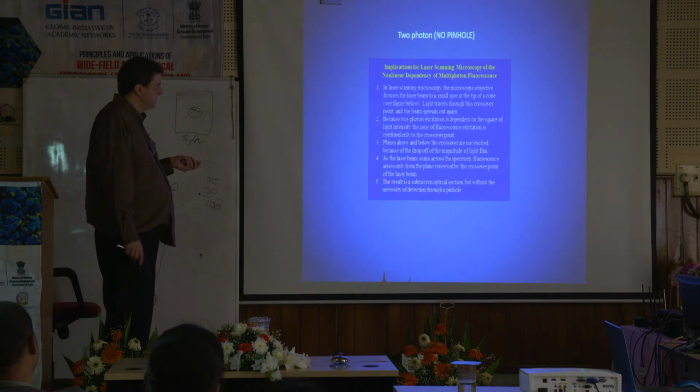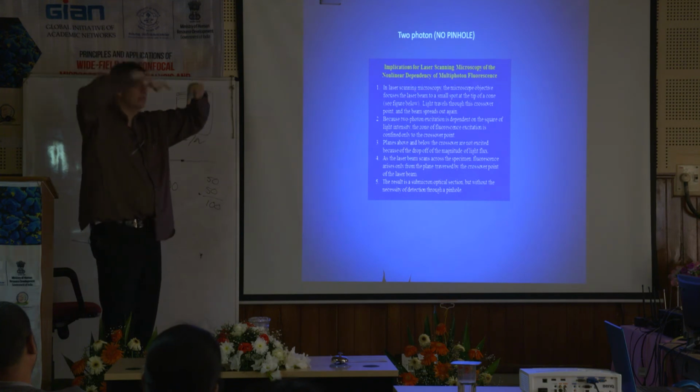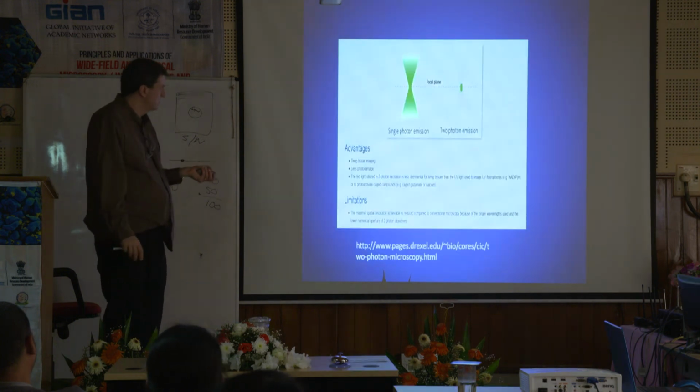Okay, so basically the take-home message, the result is a sub-micron optical section, but without the necessity of it coming through a pinhole, because you don't need a pinhole because the only place it's going to work and excite something is where it hits. So you have that really tiny area where those 2 photons actually meet each other and hit and excite that one molecule. Okay, so it avoids the pinhole.